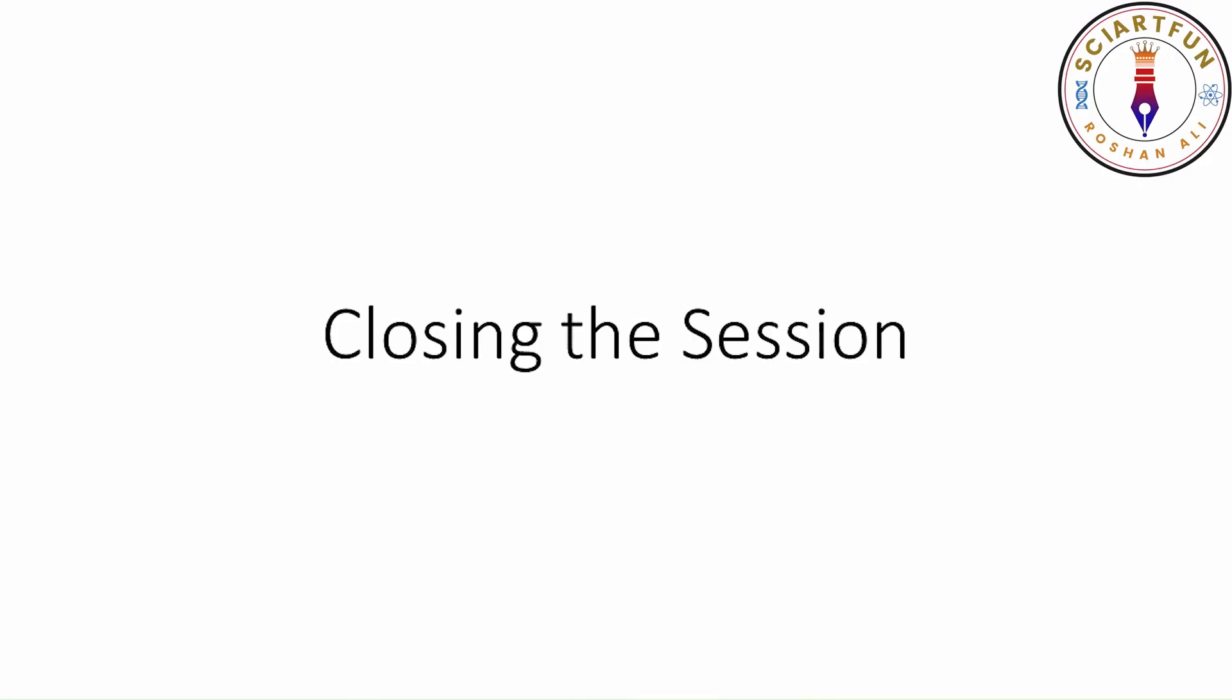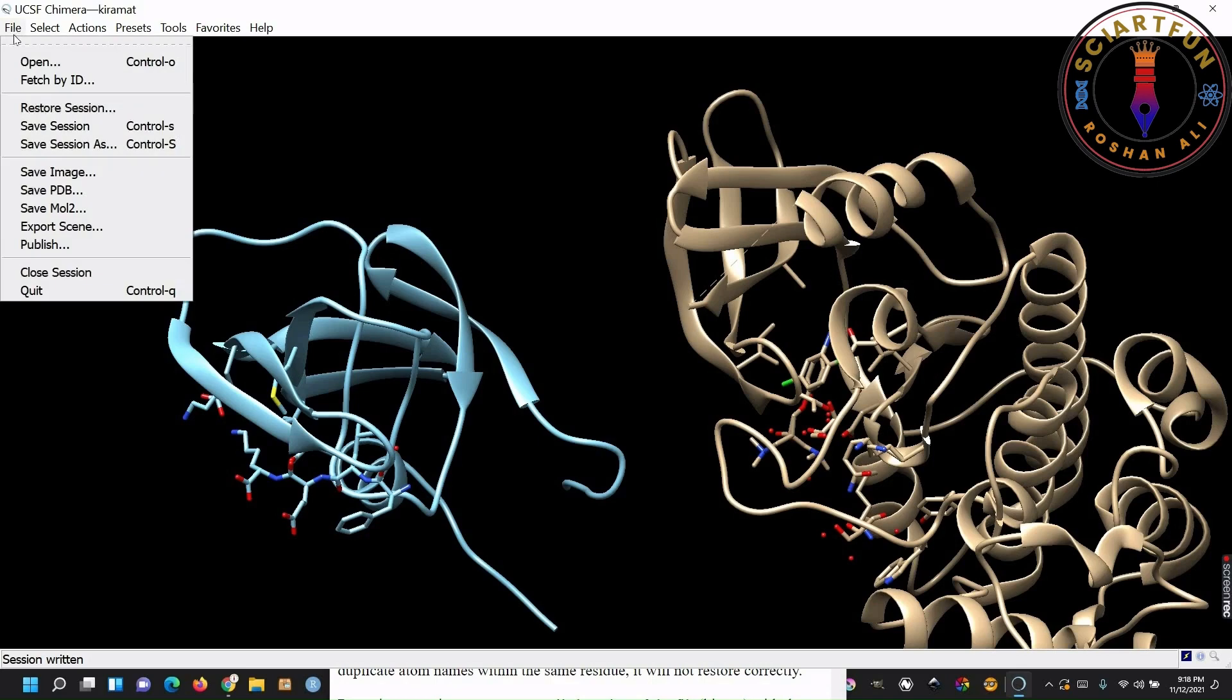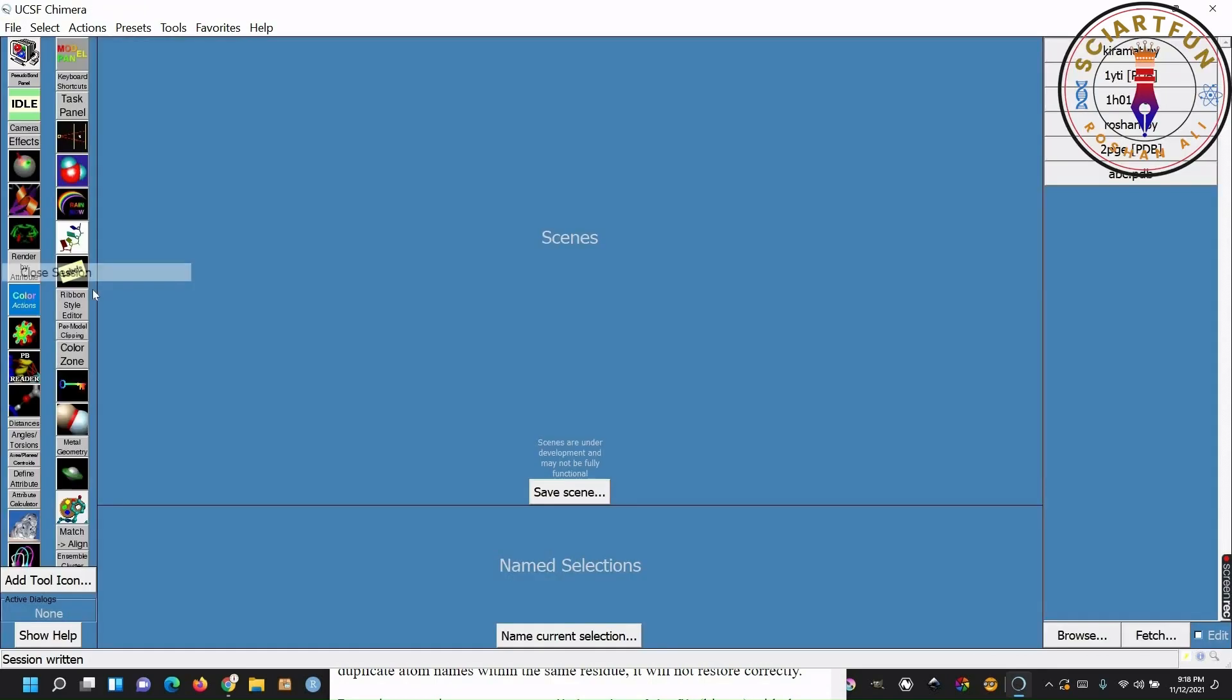How to close an open session. Just go to file menu and click on closed session. The session will be closed.